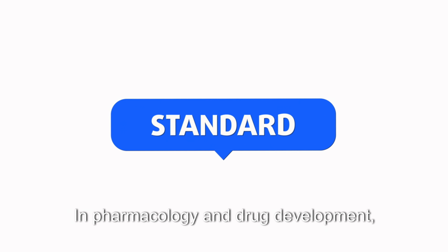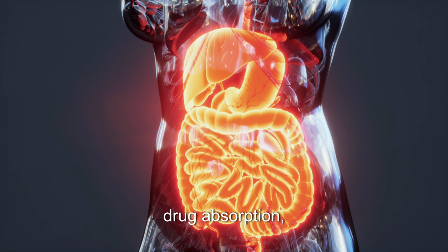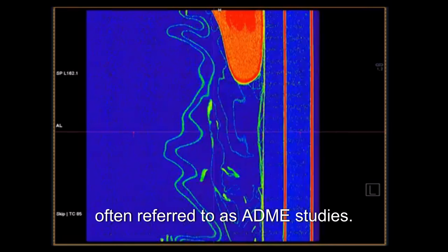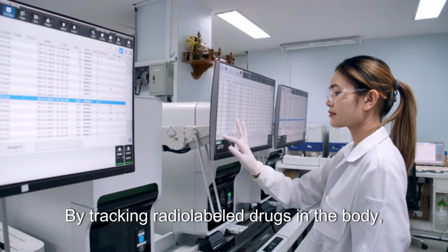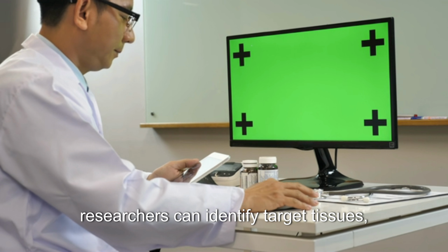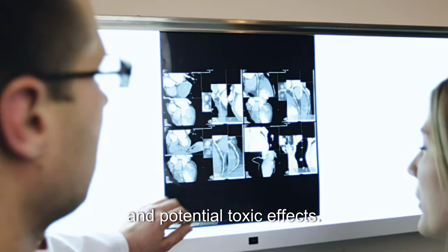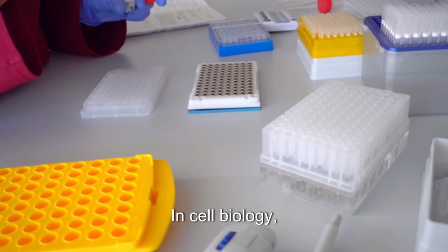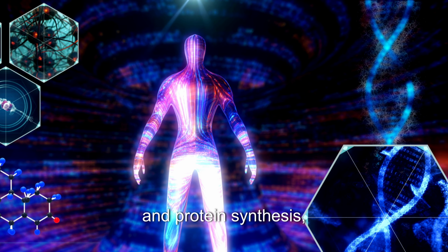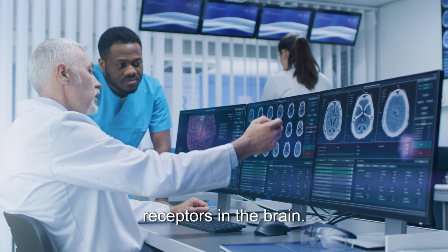In pharmacology and drug development, autoradiography plays a critical role in studying drug absorption, distribution, metabolism, and excretion, often referred to as ADME studies. By tracking radio-labeled drugs in the body, researchers can identify target tissues, accumulation sites, and potential toxic effects. In cell biology, autoradiography is used to study cell division and protein synthesis, while in neuroscience it is used to map neurotransmitter receptors in the brain.